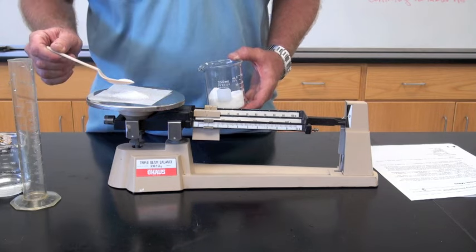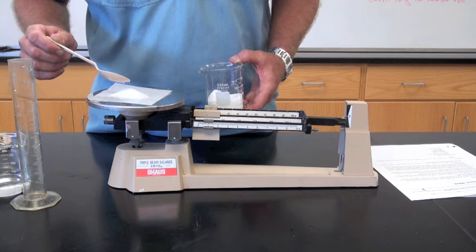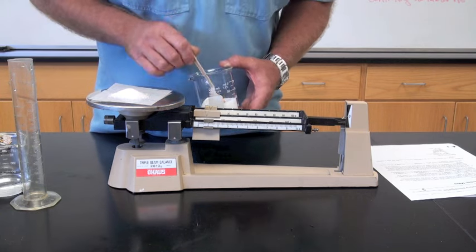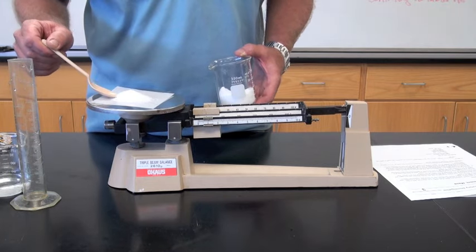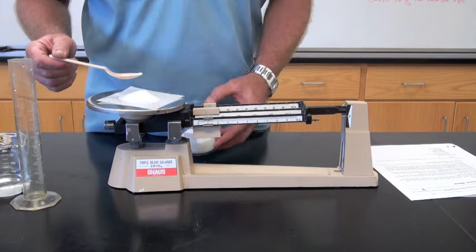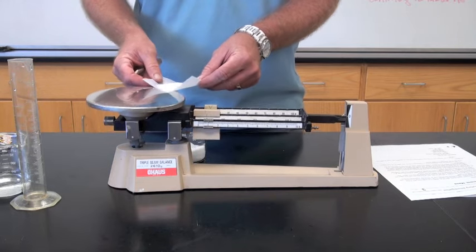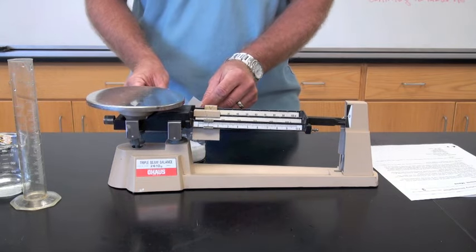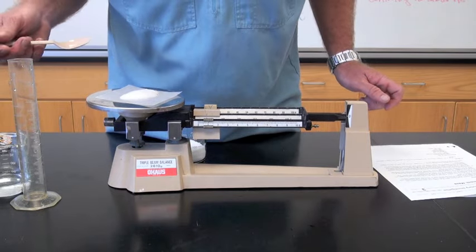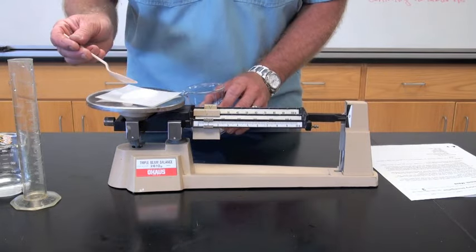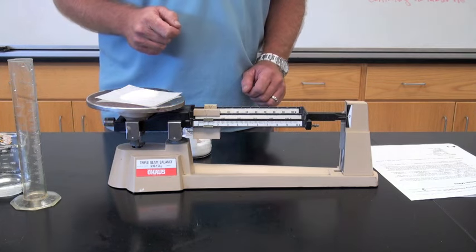Remember, you can always add more. Don't go too fast. Go nice and slow. Oops, I went too far. I have to start all over. A teeny bit more. Now I've measured out exactly 10 grams of my solid chemical.